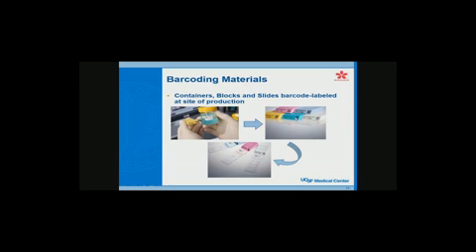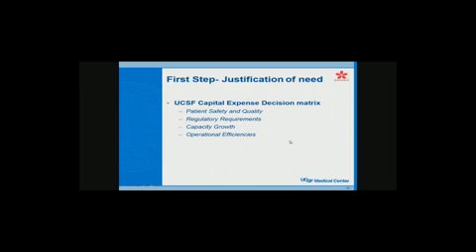This slide shows the ideal of what we're working towards. You have a container that has a barcode label, or we call it a barcode. It's actually a 2D code, but barcode is the nomenclature that everybody likes to use. It's a little bit easier. You scan that container and you automatically print out a barcoded block or cassette.